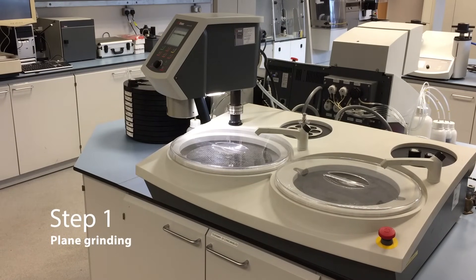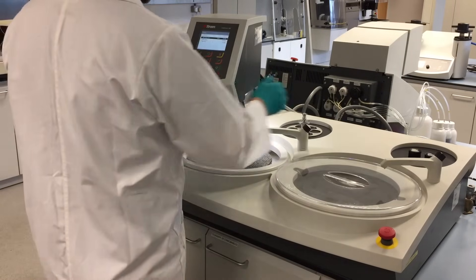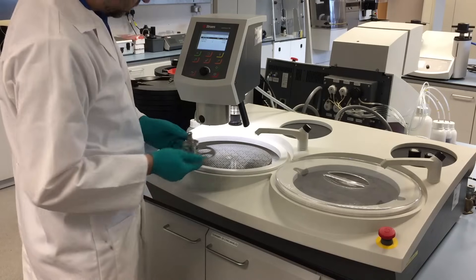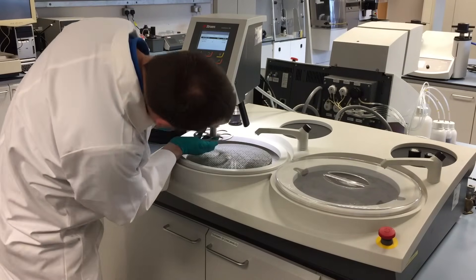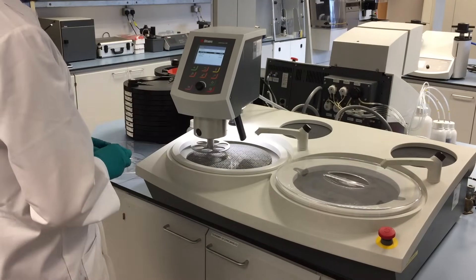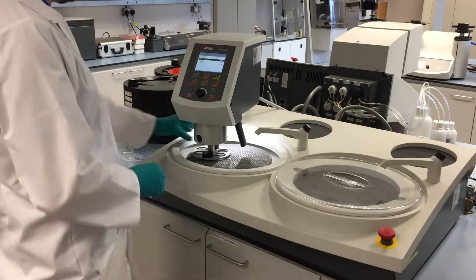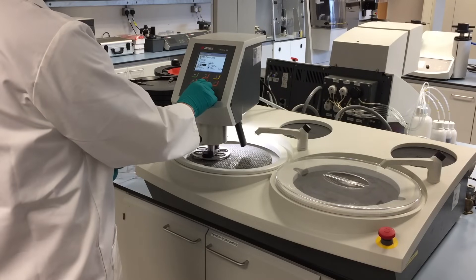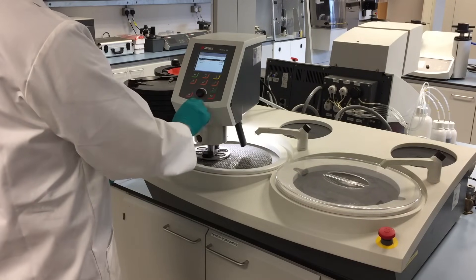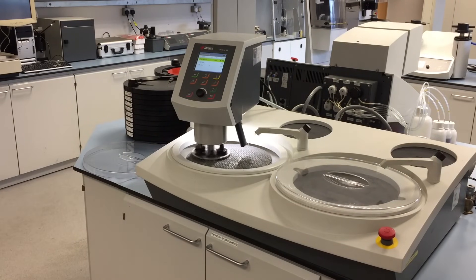The plain grinding stage. Easy setup and preparation. Matt's now going to start by positioning the specimen mover head, inserting the specimen mover plate, dropping the force head and placing the samples ready for preparation. Now checking the selected preparation program, and the plain grind has started.